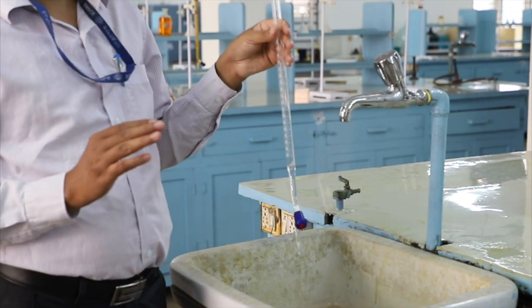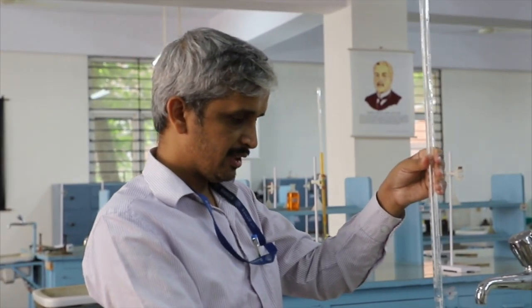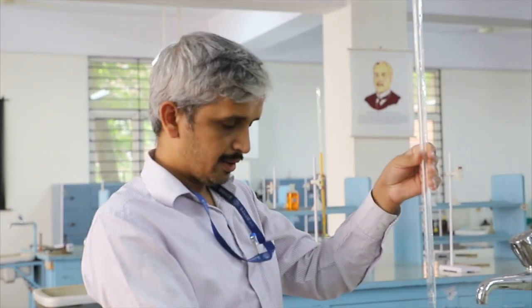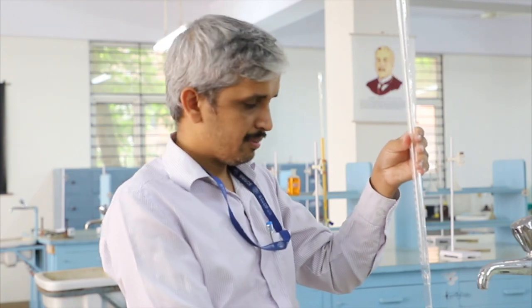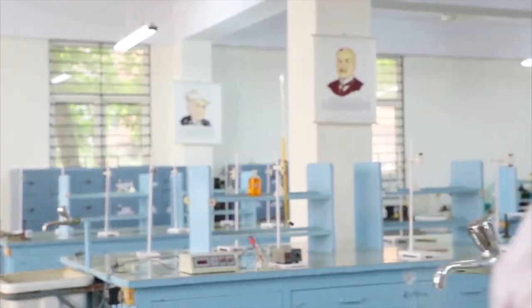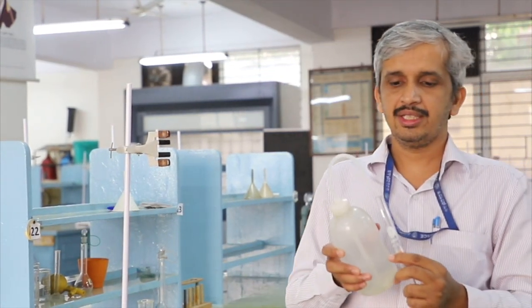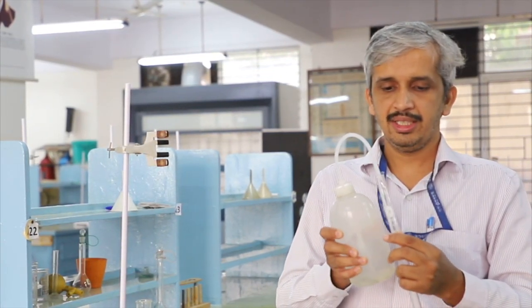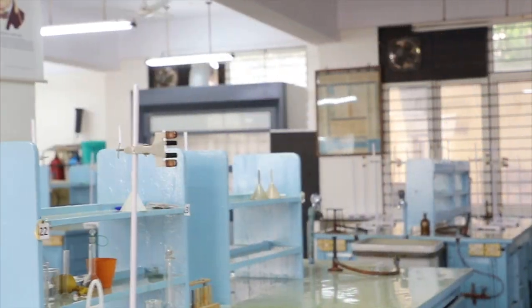That means whatever apparatus is collected in the lab, the first thing is all of them should be washed in tap water. After that, all of the apparatus should be rinsed with distilled water. Now I have washed this with tap water. Tap water may be contaminated, so therefore it should be rinsed with distilled water. I am using a little bit of distilled water and rinsing this.